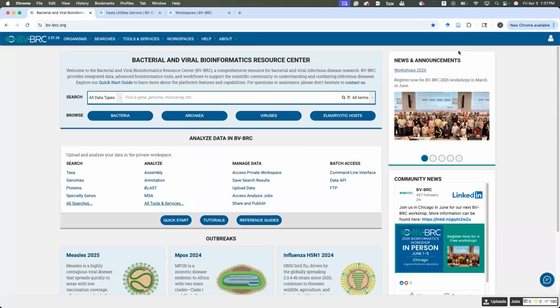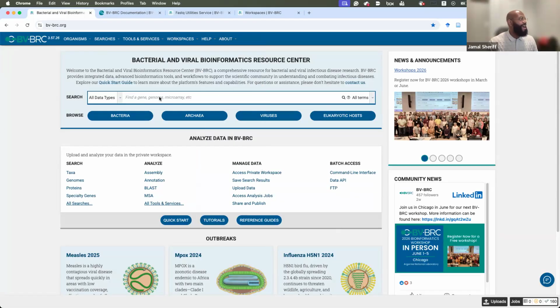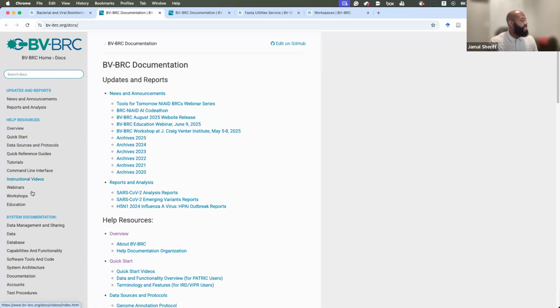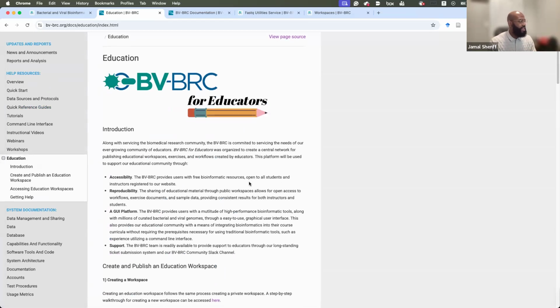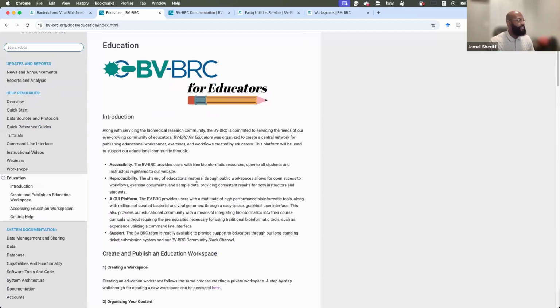Jamal, we have a question in the chat. Could you show them again how to access the education page? Okay, yes, the documentation page. We're on our homepage for the BV-BRC. You can click on documentation website. In here, you can see our sidebar of help resources. You can click on education, and that will bring up our BV-BRC for educators documentation page. It has all the information that I mentioned earlier in regards to making your educator's workspace.